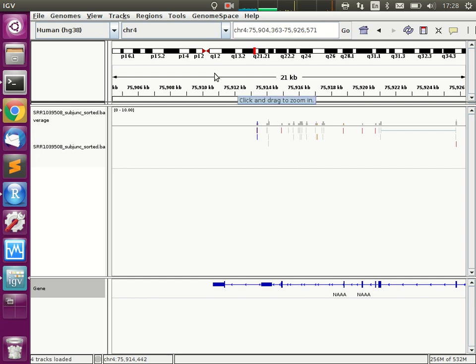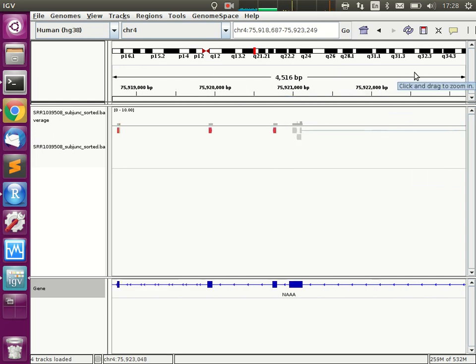RNA-seq reads don't sit only at the... yeah, it's really a bad thing. What I would hope to see is that over the exons you always see the signal going up and down. There are always stretches which have hardly any reads and other stretches where 6 or 7 reads pile up on top of each other. This is PCR bias. Some fragments amplify much better than other fragments, and so after your 15 rounds of PCR amplification, you suddenly see much more reads from some parts of the genome than from other parts, simply because PCR efficiencies are quite different.